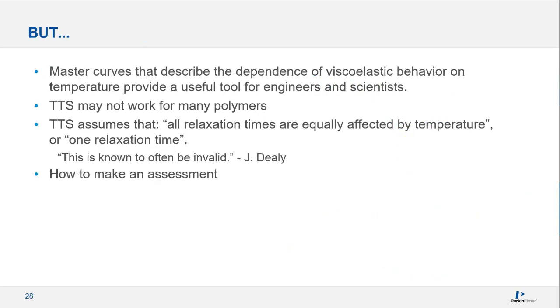Master curves and TTS can be a very useful tool for engineers and scientists. However, it should be stressed that TTS is a modeling technique, and the results may be incorrect, misleading, or wildly inaccurate in the worst cases. It is up to the scientist carrying out the measurements to make an assessment of the validity of the data, and this will usually involve a correlation with other forms of measurement. I will show one method later to assess data in the next slide. A full treatment of the technique and its theory is outside the scope of this talk.